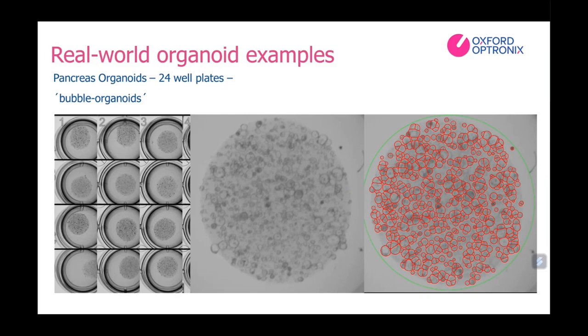And again, here's the second image. Our suggestion, while we can count this, would be that these images perhaps should be taken when the organoids are smaller, or if they need to be seeded to this rate, that they be seeded a bit less or the domes are made a little bit larger. But again, you can see how we are able to get counts here where somebody manually very likely would not be able to.